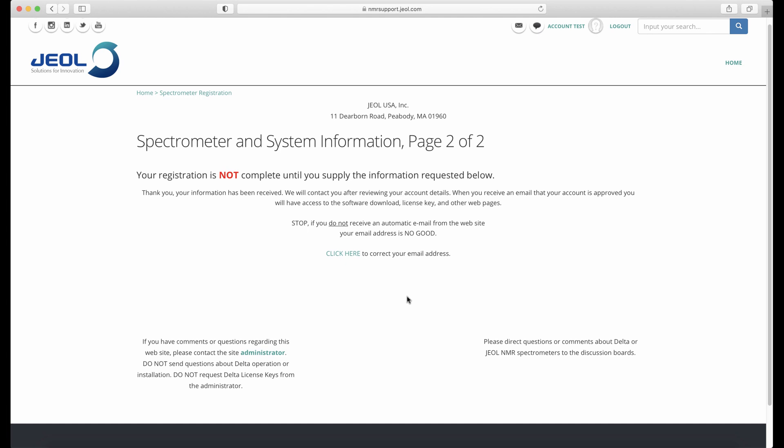If you are not receiving emails, it means that the email address you entered is not valid and you need to go through and correct it.